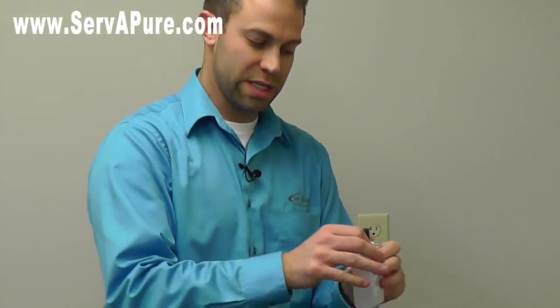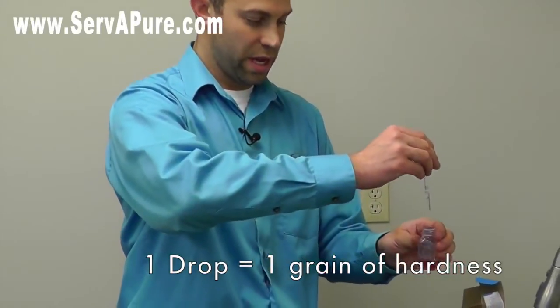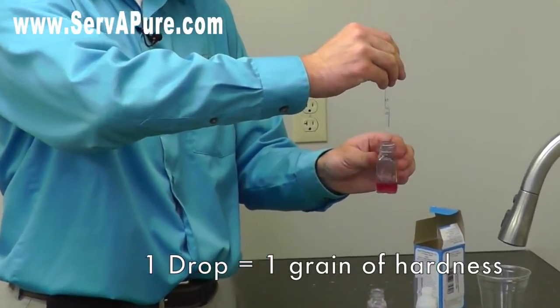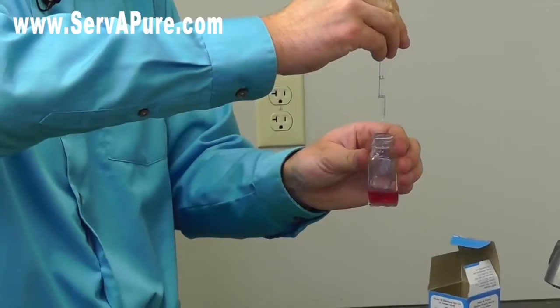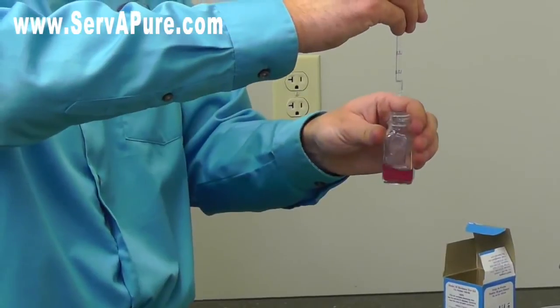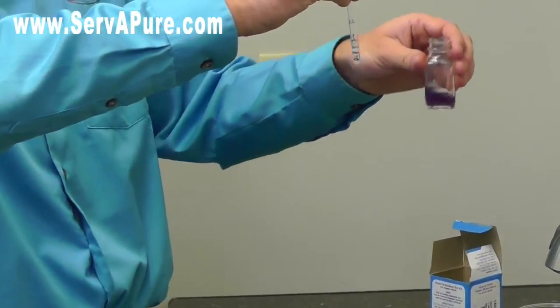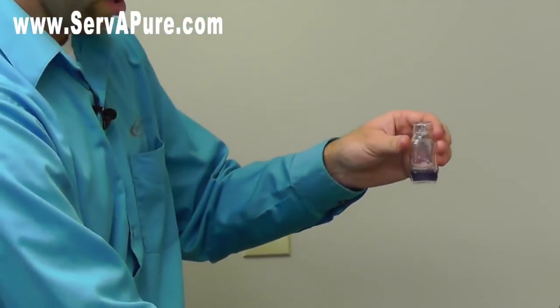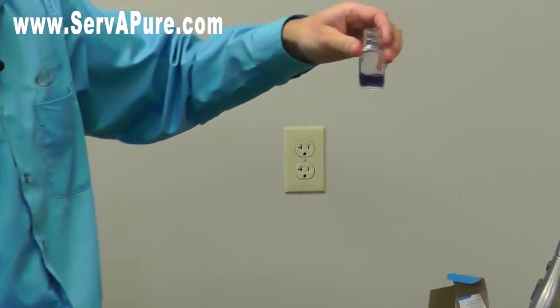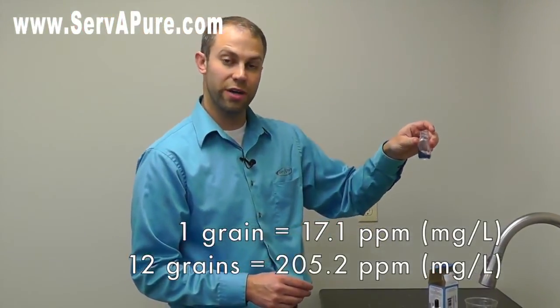Now we want to see how many drops it will actually take to get that pink color to a blue. We use the eyedropper — fill it up and keep it level, straight up and down, and count how many drops it takes. One, two, three, four, five, six, seven, eight, nine. Shake it around a little, make sure everything's getting mixed up. Ten, eleven — and it's kind of changing to a purple color. So we go one more drop: twelve. Now it went from that purple to a nice blue color, and that means you have 12 grains of hardness in your water.